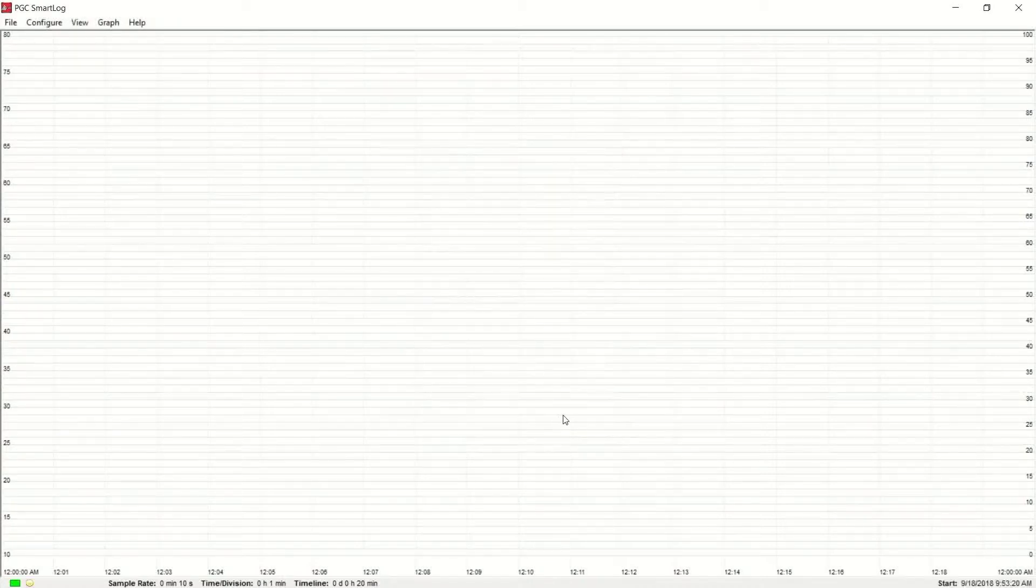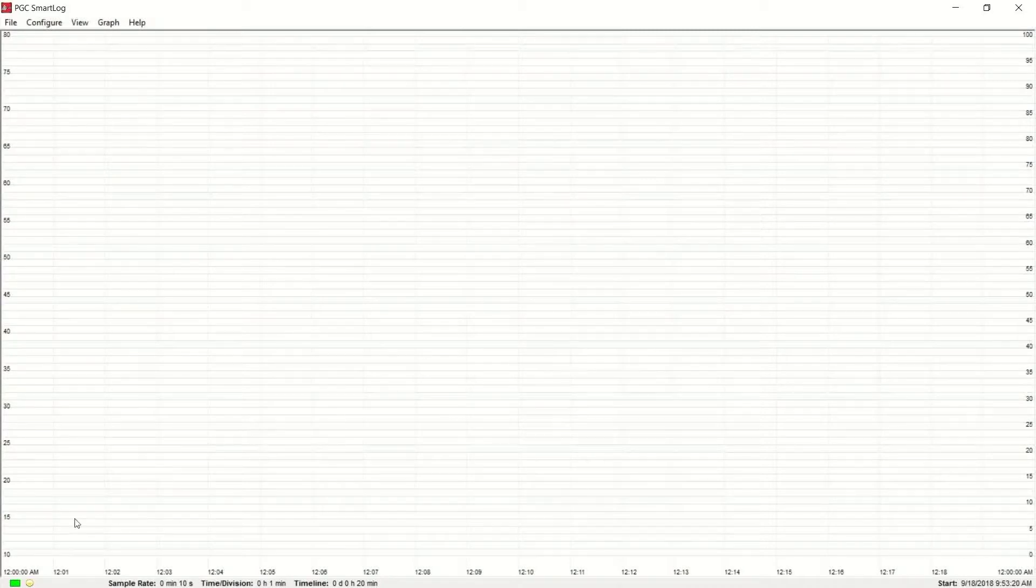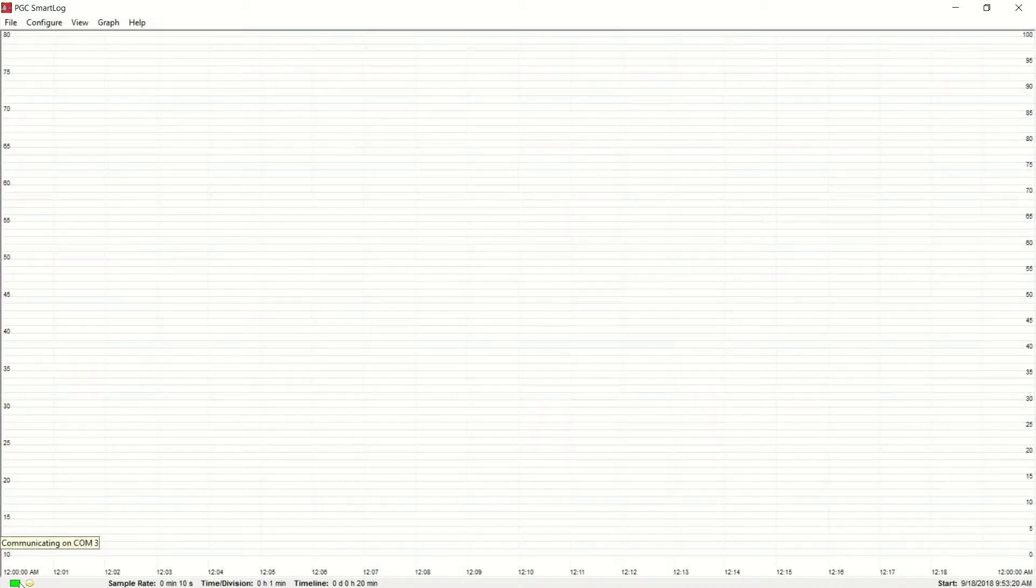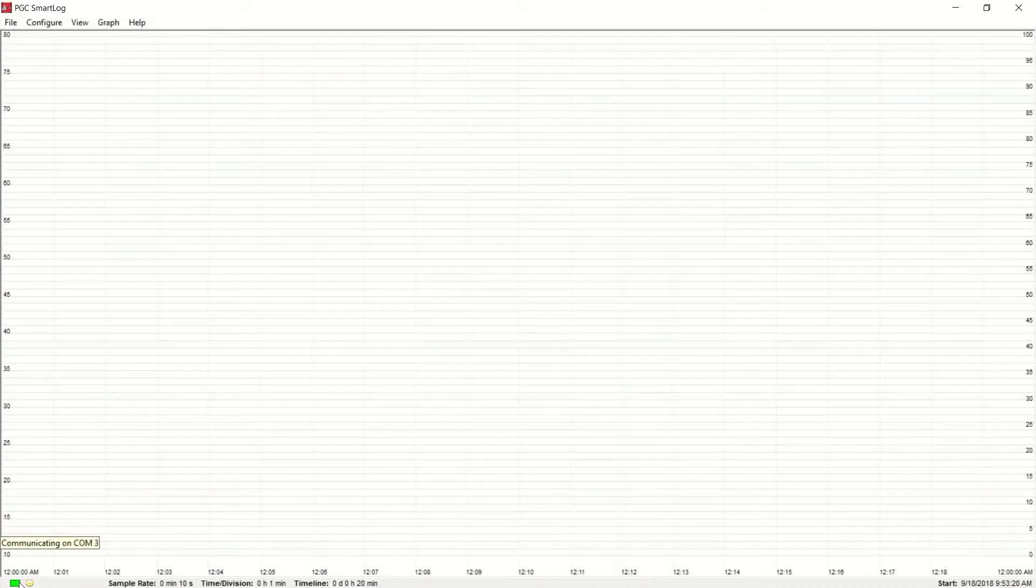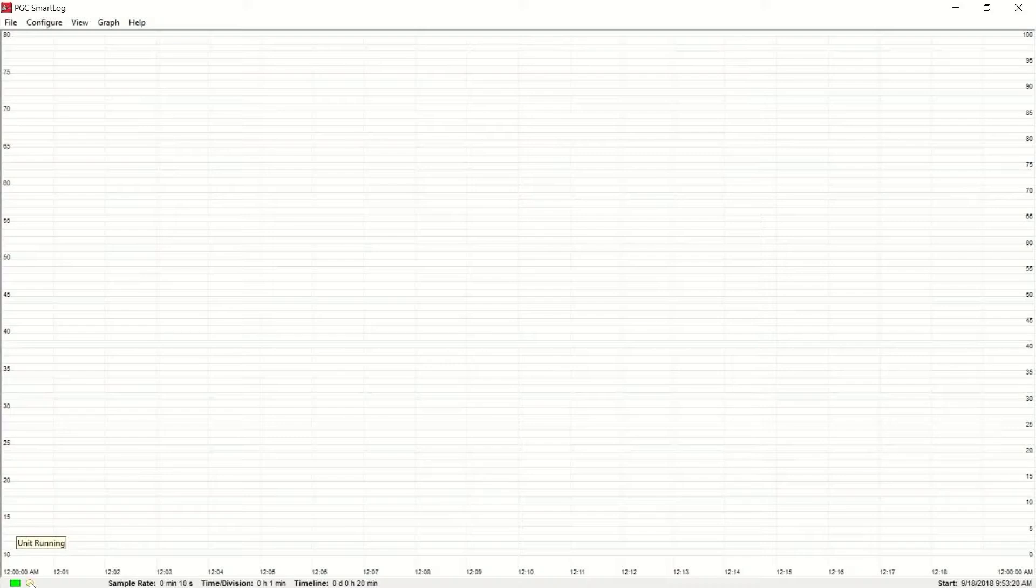You'll see two icons in the lower left corner of your screen. The green box indicates communication between SmartLog and your parameter unit has been established. The yellow circle indicates that your parameter conditioner is currently running.